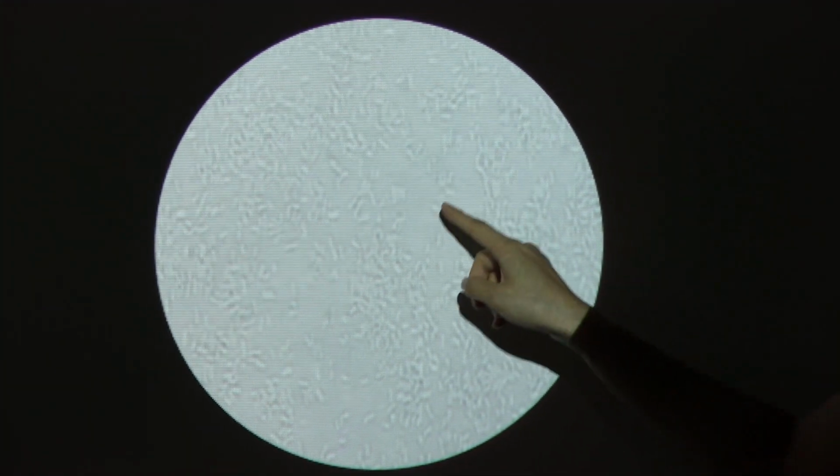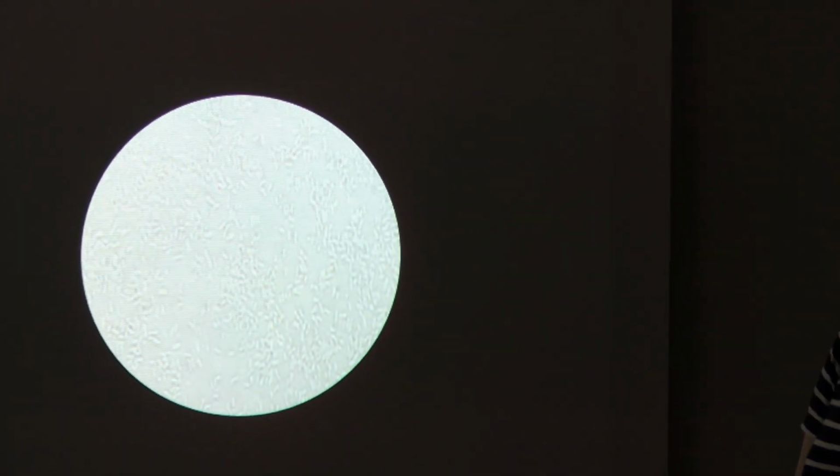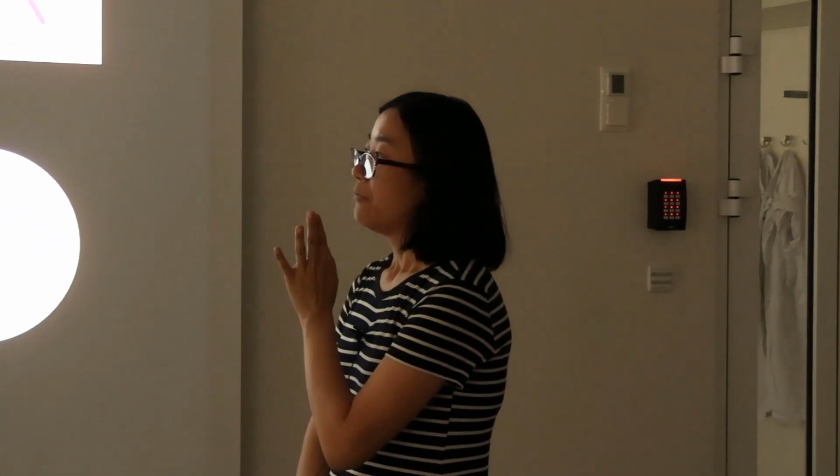You can see that you couldn't really distinguish the cells from the background without staining. This is because of the low contrast of the light in the bright field microscope, because as I told you before, the light is without any modification when it goes through this instrument.